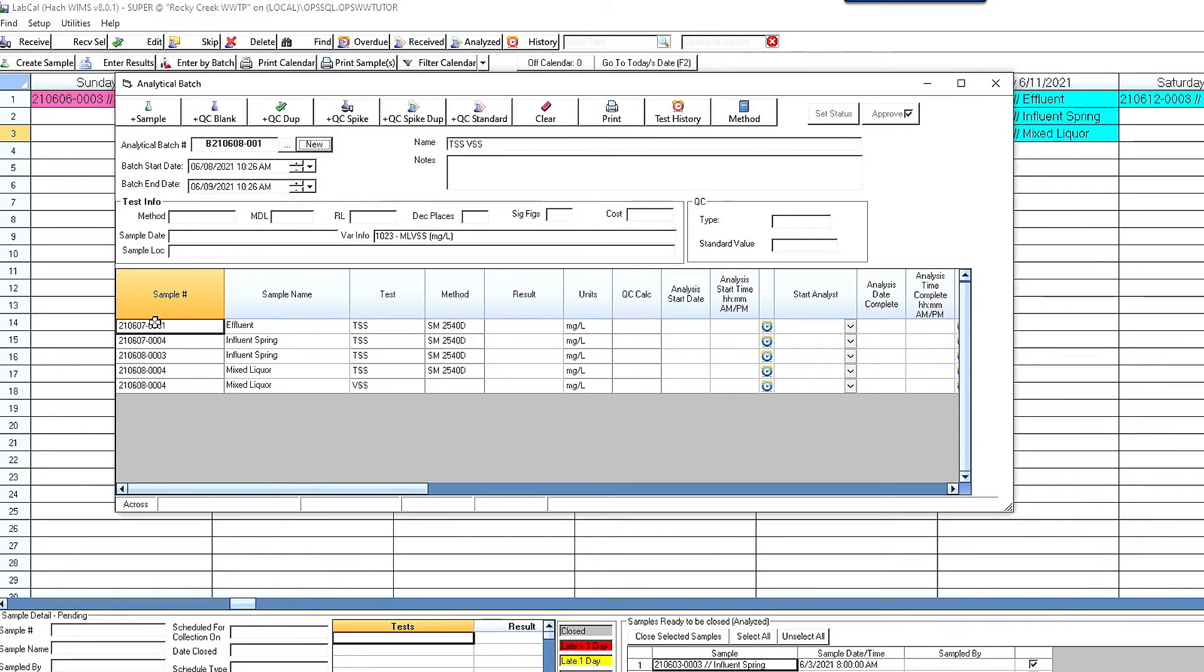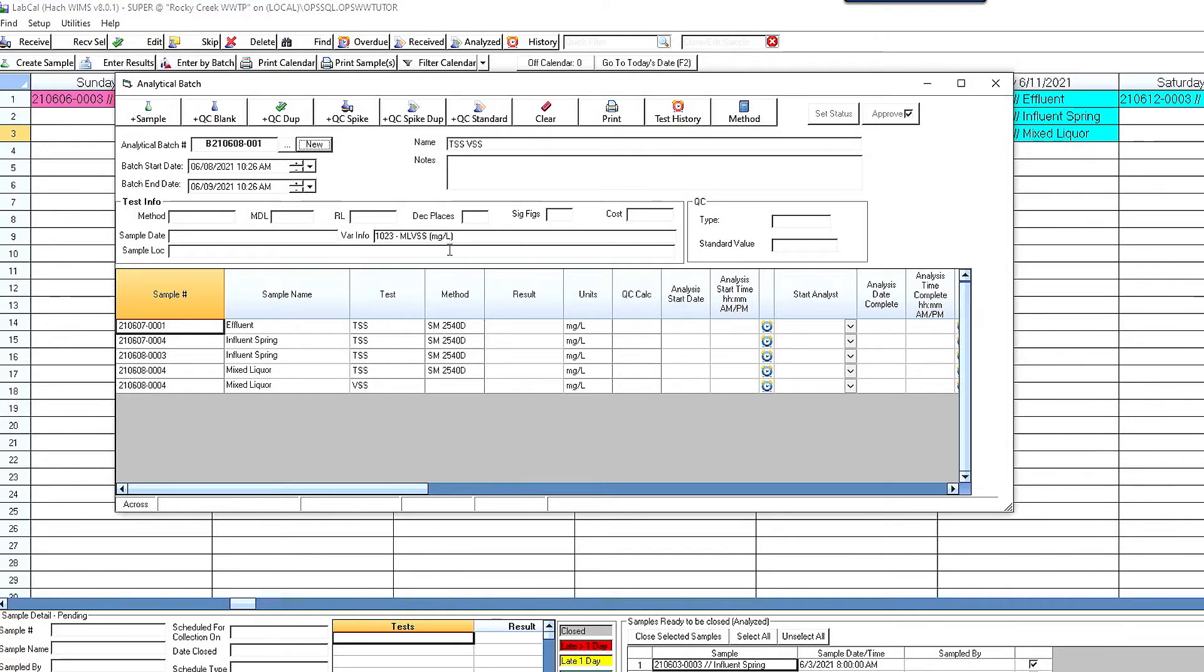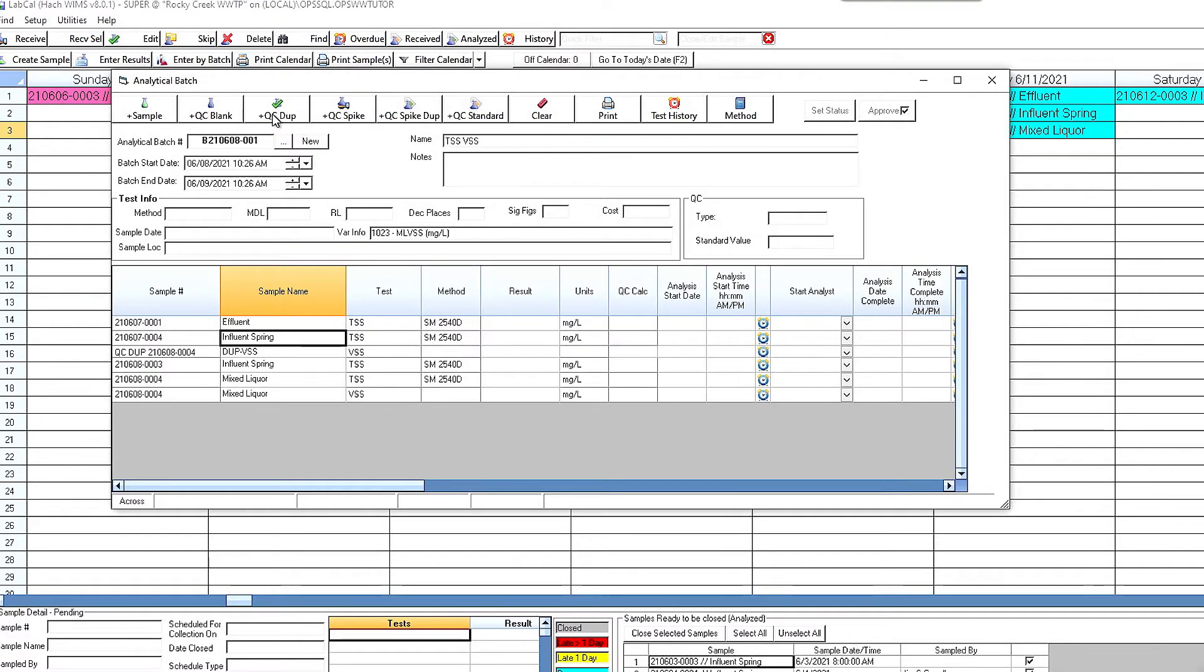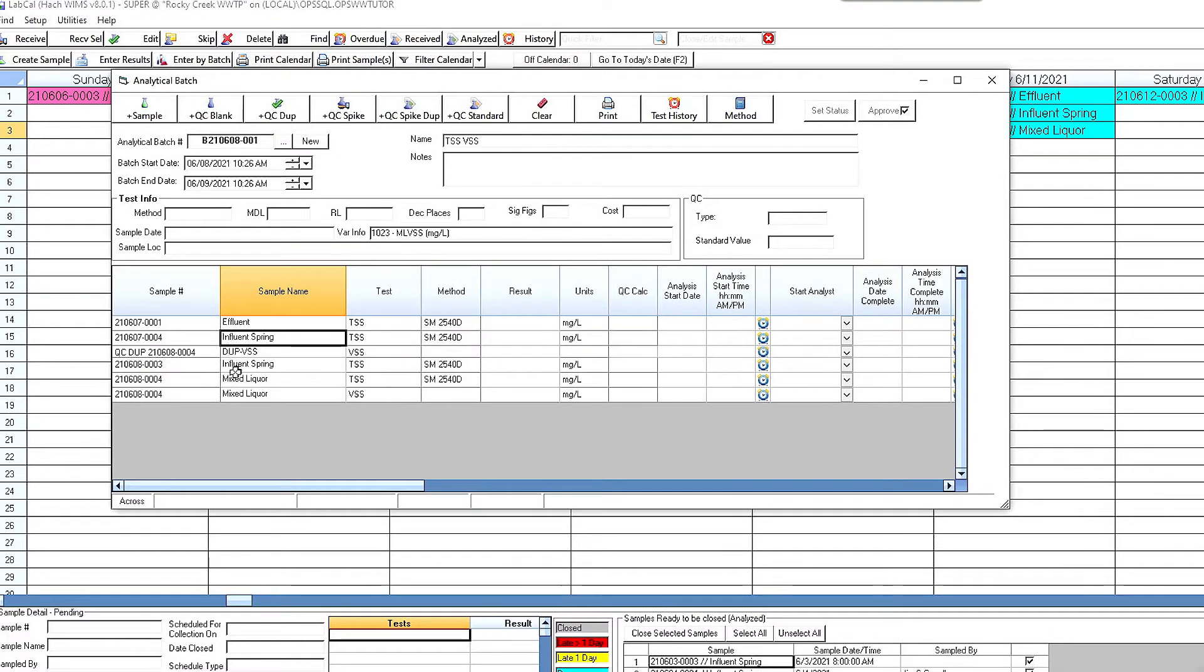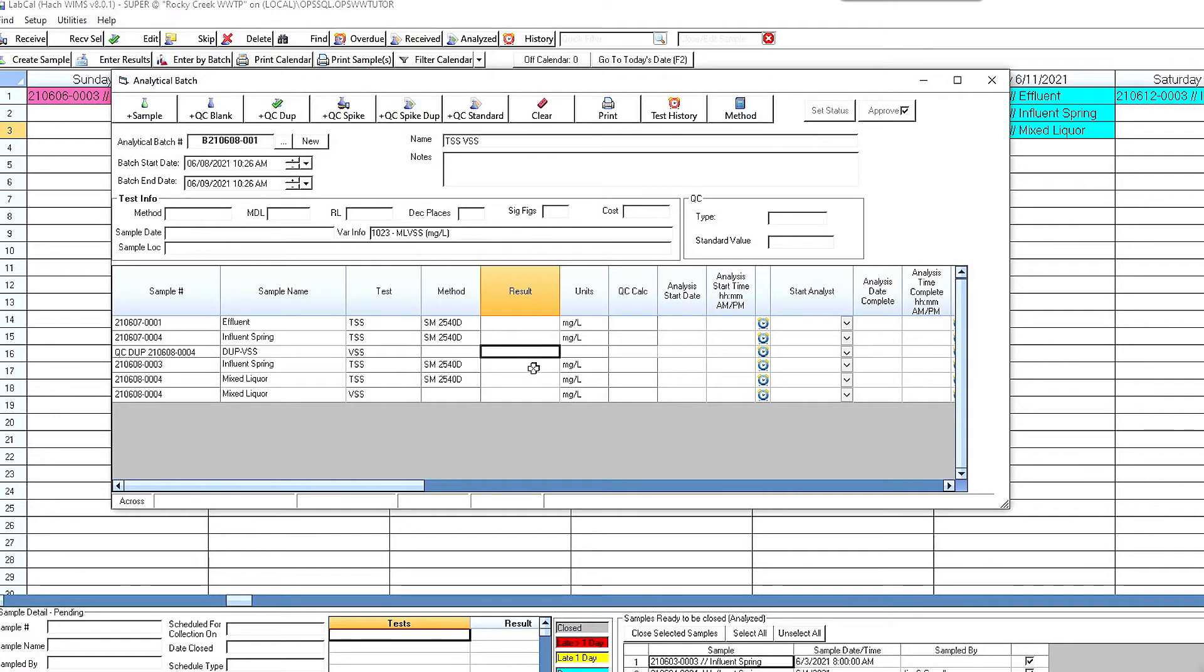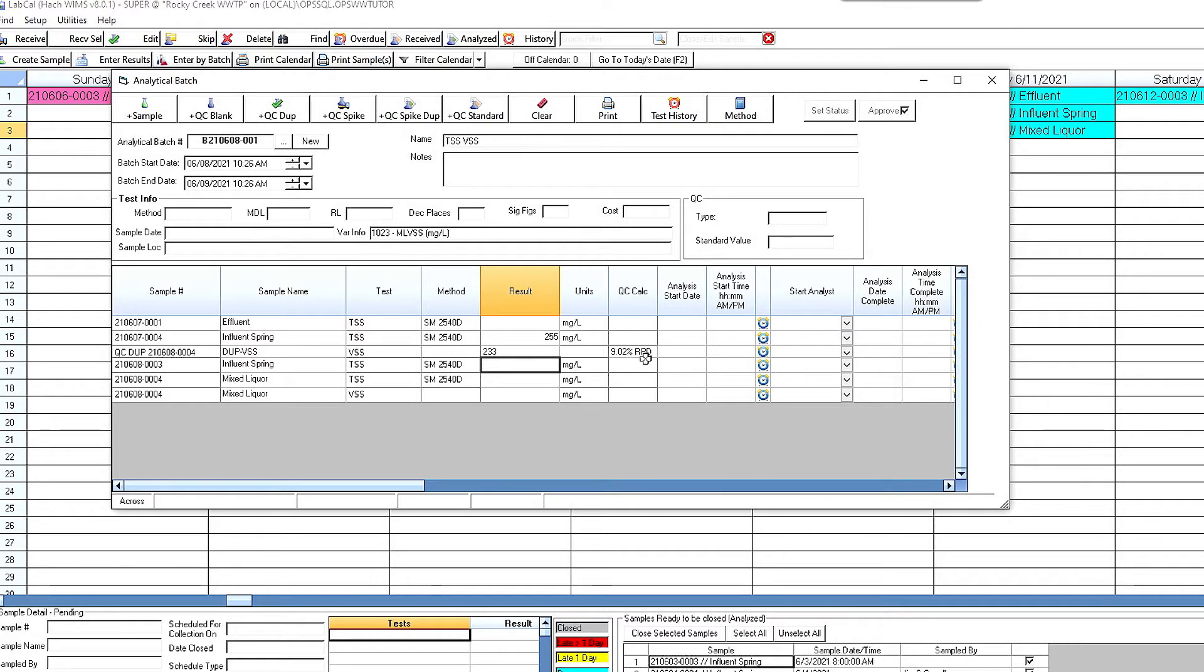It gives it a name. I can edit that. And in here it shows all of that data. Now I can go ahead and I can enter in my results. I can enter in my analyst, my finish analyst, start analyst, all that data. But what's really nice here is I can add in my QC. So this test has been set up to do a duplicate, the TSS test. So when I do it I highlighted influent spring and now it's going to associate that duplicate with that test. So what I do here is I'm going to come in here and I'm going to type in the TSS result of 255. I'm going to go to here and let's say the duplicate is 233 and notice it automatically calculates that relative percent difference.